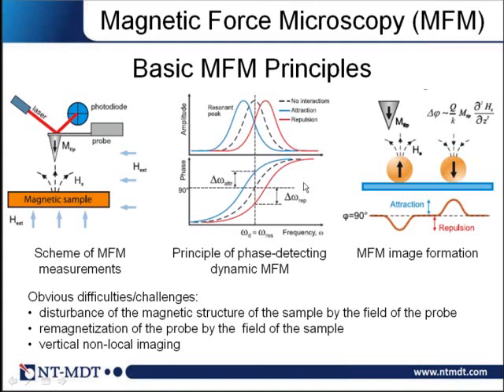And now the development goes in some aspects of biological studies to put nanomagnets on biological elements like cells, and detect these cells by detecting the magnetic field of these nanoelements. So I'm not aware of MFM images on such elements, but I'm sure that development goes in that direction, that sooner or later such images will appear.